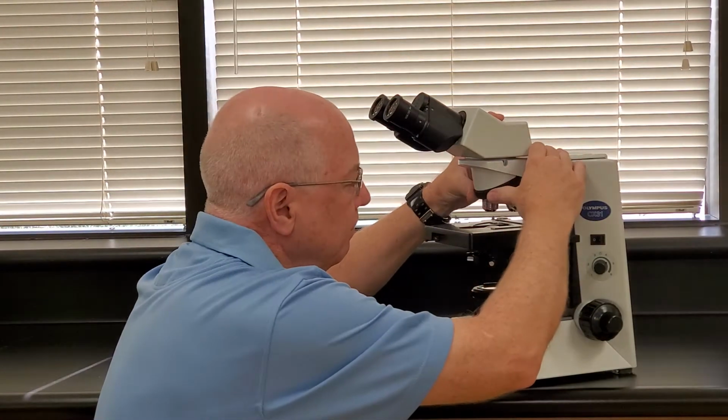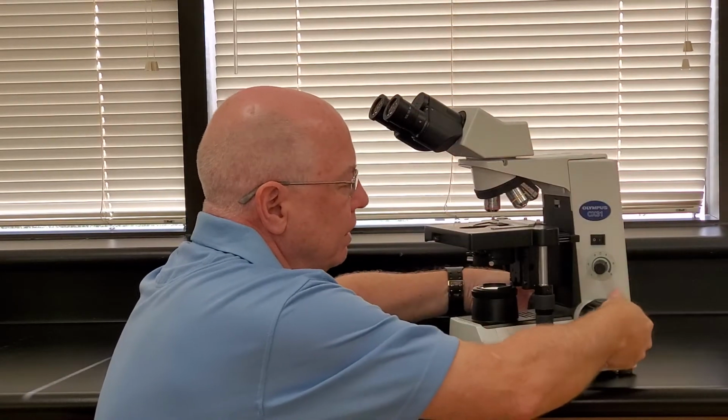When you are done, you always go back to the red objective, lower the stage with the coarse focusing knob, and then you take the slide off and you're back where you started. Okay? That's sort of a how to use the microscope and what are the parts of the microscope together.